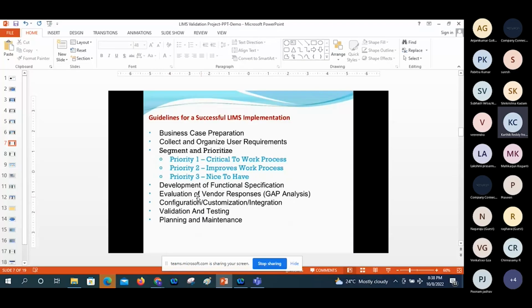Once it is done, they can go for finalization of the complete workflow according to each and every module. If the requirements are not satisfied properly, they can evaluate through the gap analysis document and update the gap assessment document properly. After that, they can again coordinate with the vendors, to check whether the configuration is properly done according to the user requirement, and update their workflow as part of the sample login templates and table managers.